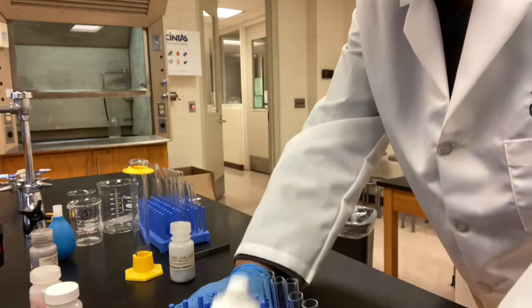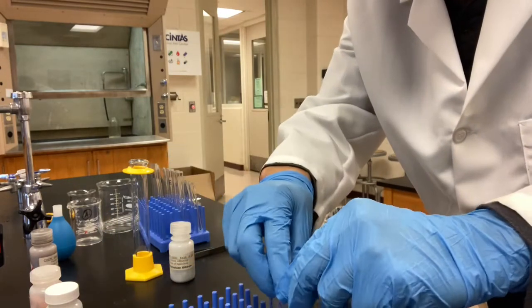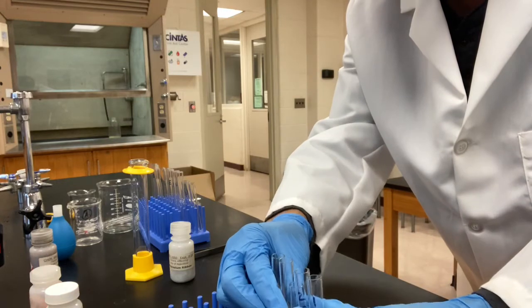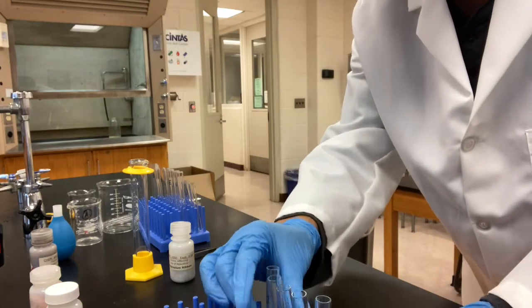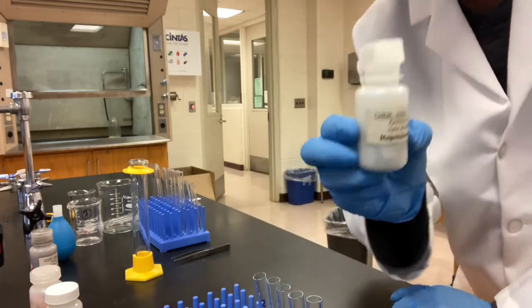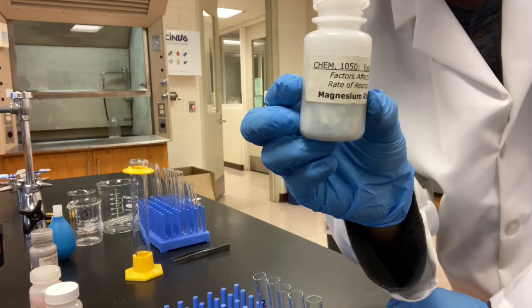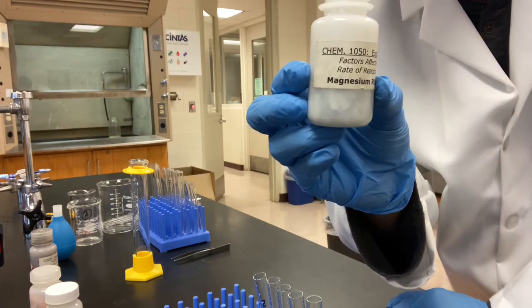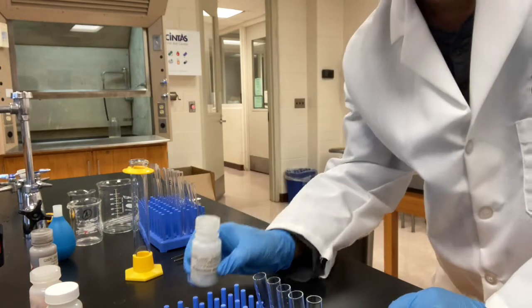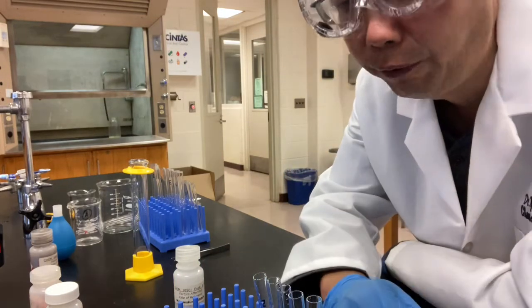So what we're going to do in this first part is add 1 milliliter of an acid to a test tube. So 5 acids, 5 test tubes. And to each test tube, we're going to add 1 piece of this magnesium ribbon. They're pre-cut for us. They're about the same size. Then we're going to observe the reaction to see which one reacts faster.